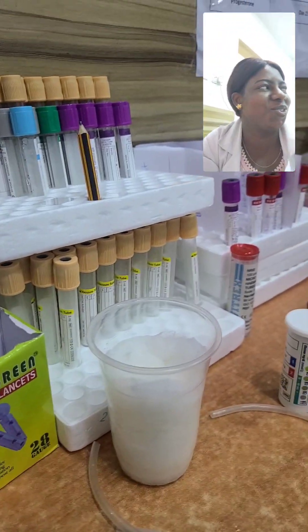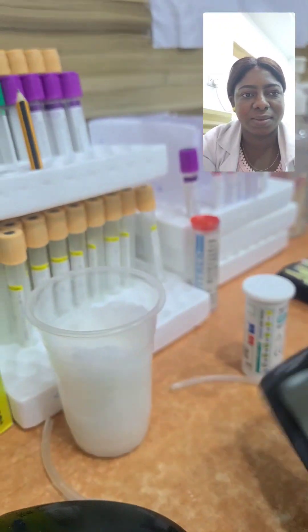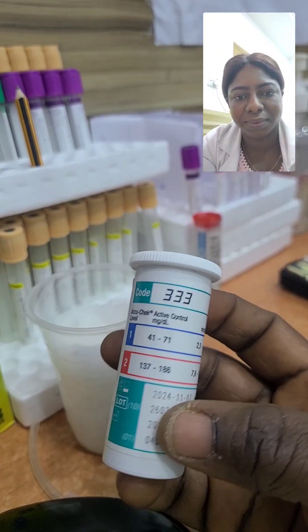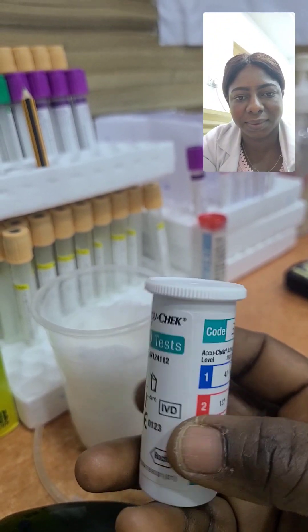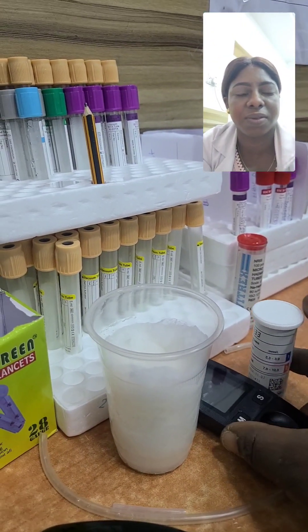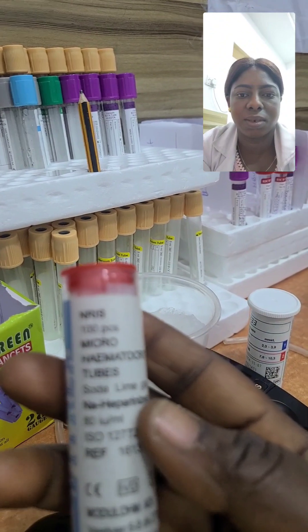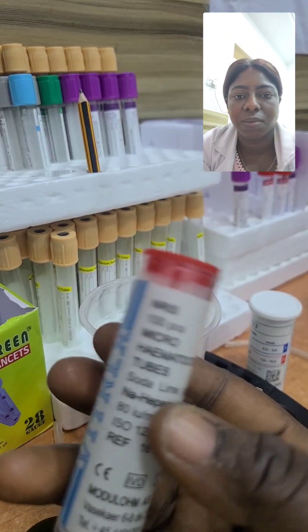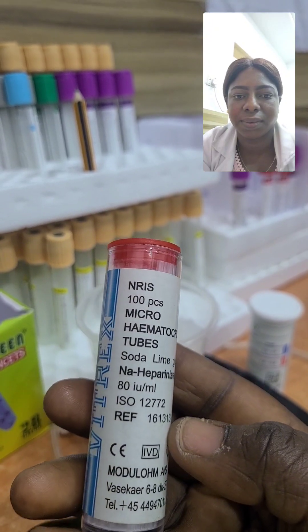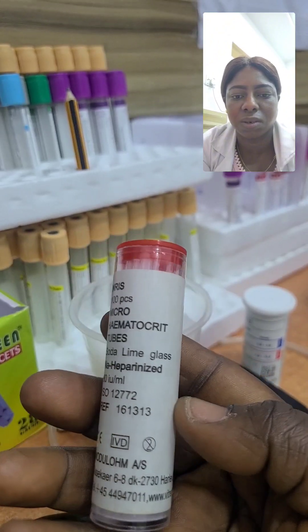This swab is cotton wool with methylated spirit to sterilize and clean the patient's body before we collect a sample. This is a glucometer with the strips — used for random blood sugar and fasting blood sugar. These are hematocrit tubes, also called capillary tubes. We use them for PCV — packed cell volume — to check the patient's blood level.